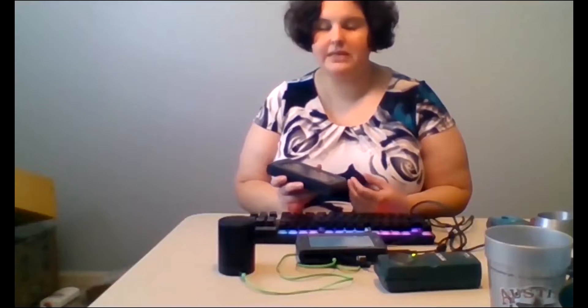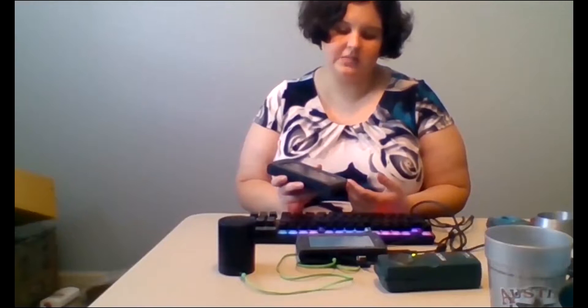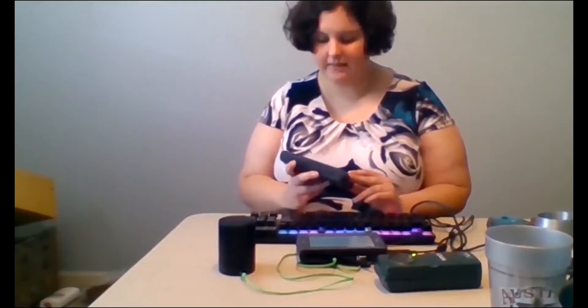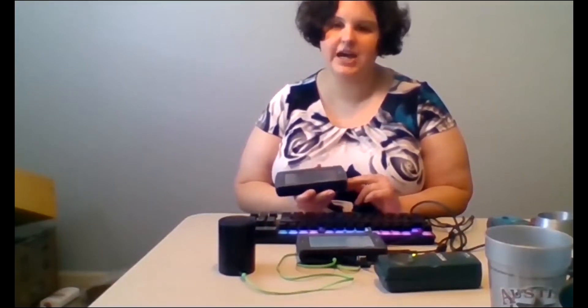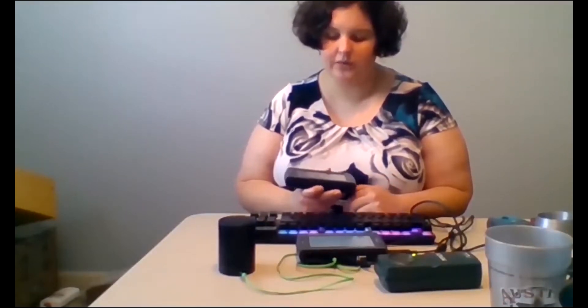Note, this is only a sampling. There are over 75 different sensors that will interface with the LabQuest, so we only have time for a few brief samples today, but if anyone has any questions about it you can feel free to write it in the chat or wait until the end for questions.